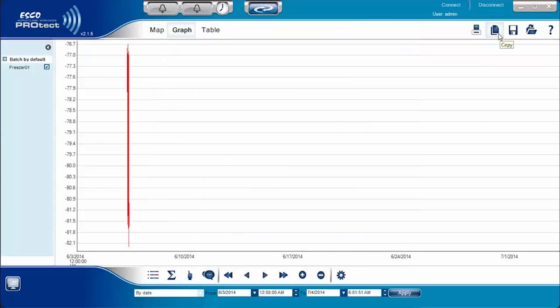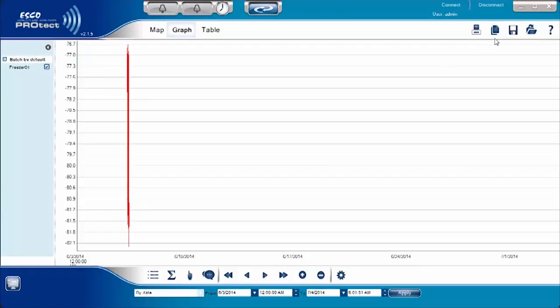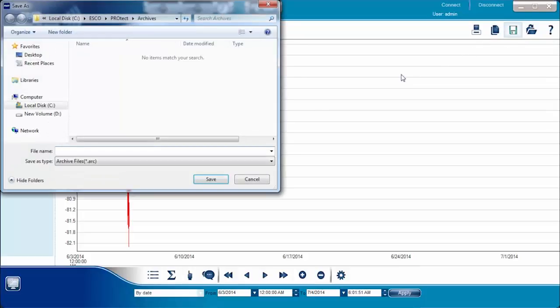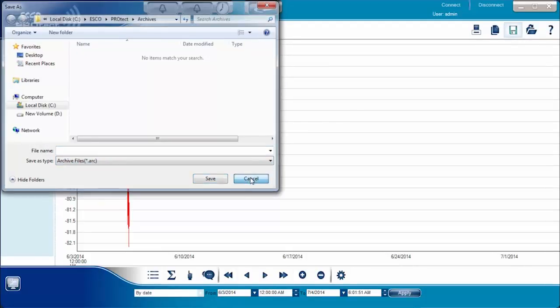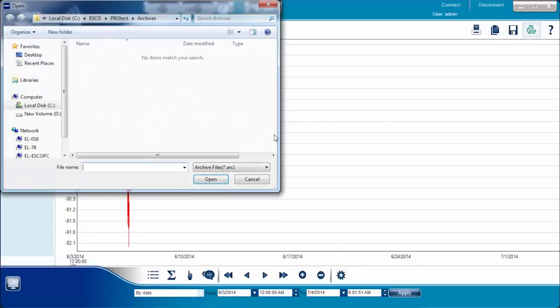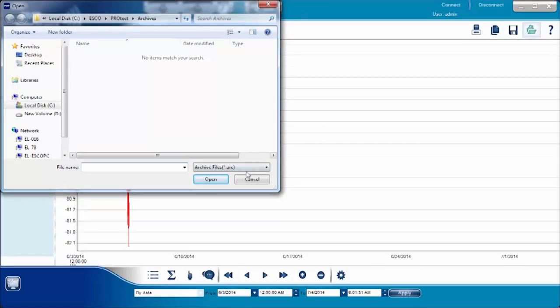The copy icon is used to copy the graph with the legend, and you can paste the image in any format such as Word, Excel, or OpenOffice. The Save an Archive option is used to save the graph as displayed, as an archive — to save a specific event or share it with another user. Download an Archive will open a saved archive; to display the archive, select the right dates on the graph.